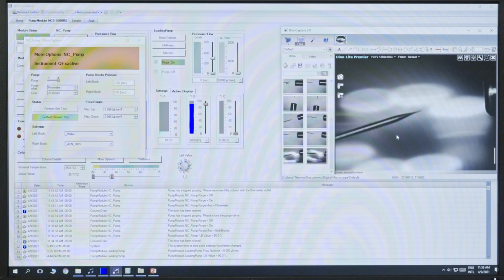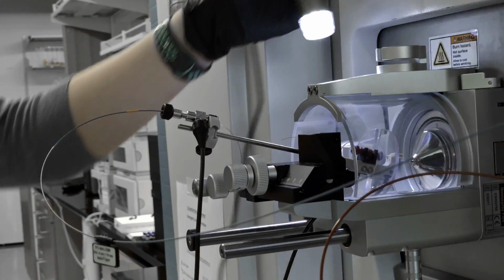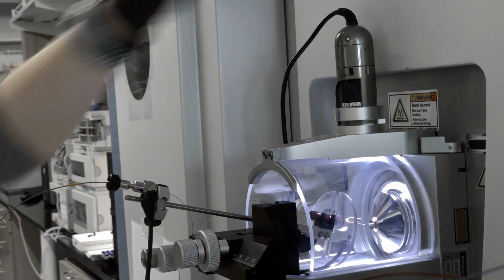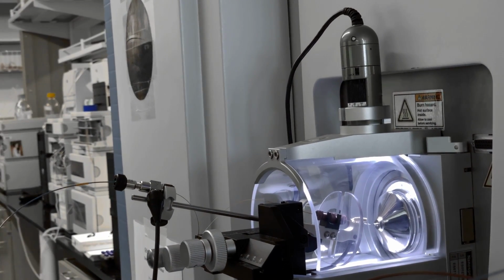So we will just slowly increase until it is pointed directly at the center of the ion transfer tube. And this you can all do while looking at the screen of the camera view. We'll place the camera to the top and get started with column equilibration.